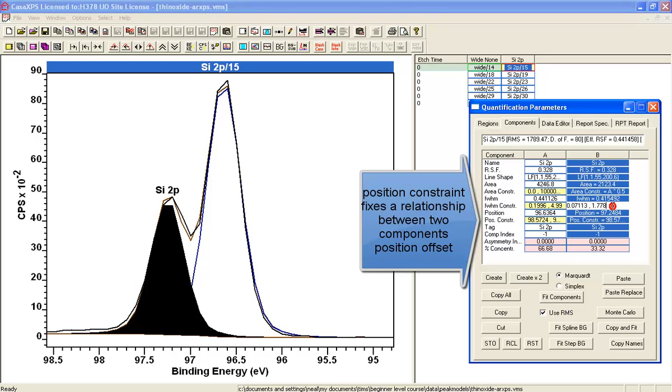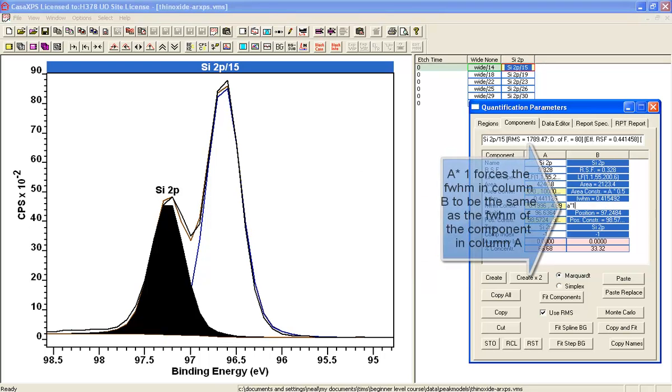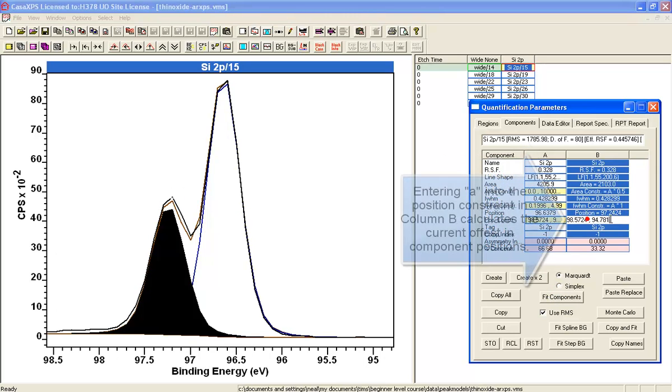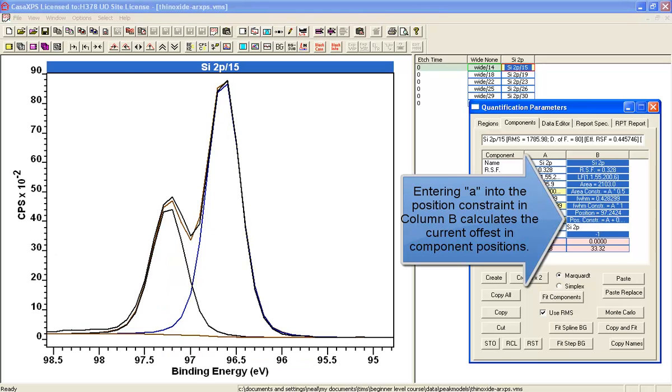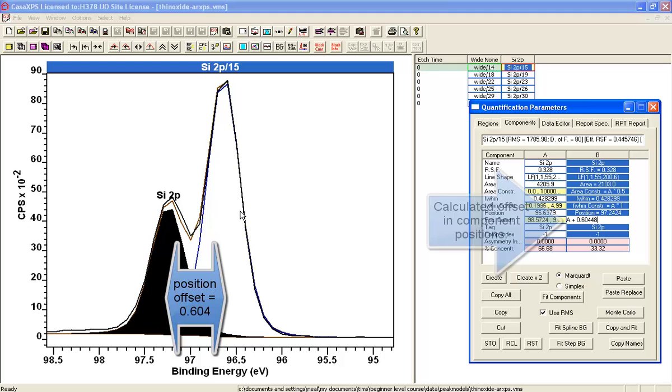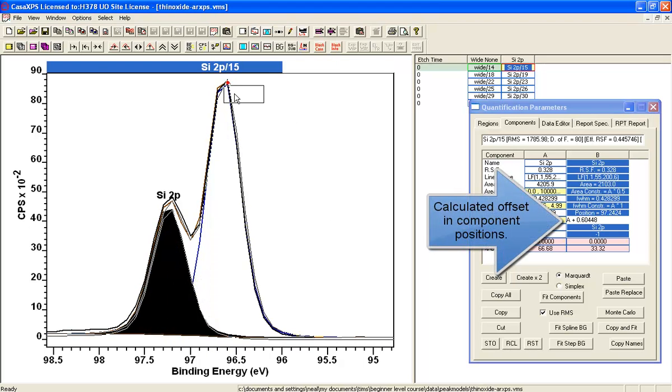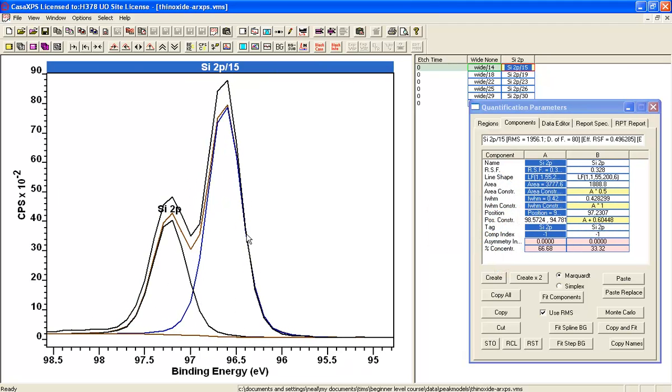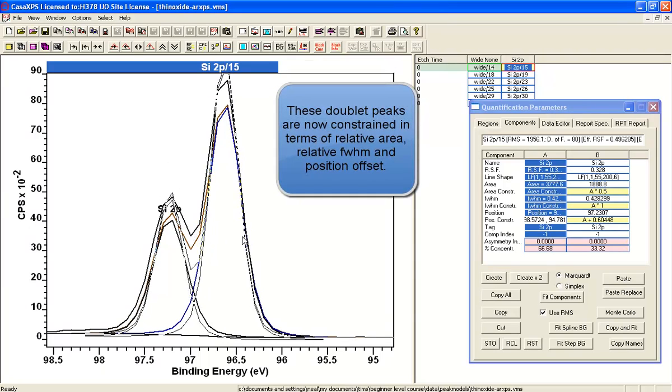Similarly, I could say that I need to have the full width at half maximum need to be roughly the same, so I will fit on the basis of that. And having done it, let's assess the displacement between these two peaks, and I'll accept that that is a plausible offset. So we've now got a pair of peaks that are completely constrained in terms of area, and the full width at half maximum adjusts together, and the position adjusts together.